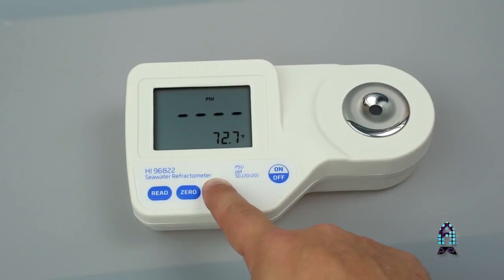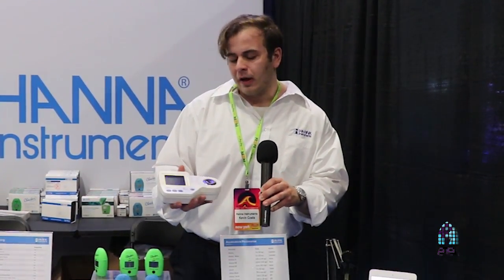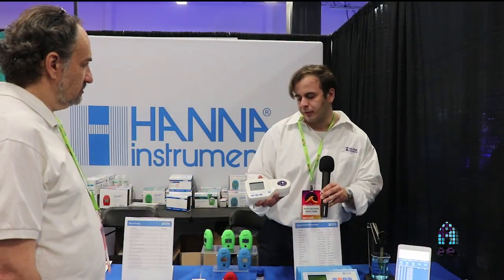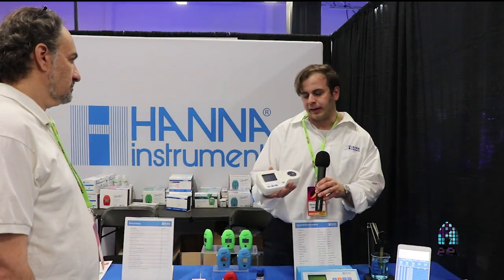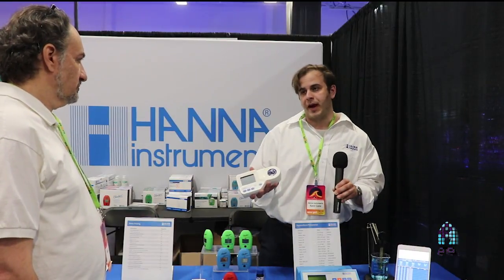Another popular unit we have is this digital seawater refractometer. A digital seawater refractometer is nothing new to the hobby, but we've had one around for quite a while that's a really great unit — something people should consider if they want really accurate salinity readings when mixing saltwater. There's no calibration needed other than RODI water, and it automatically compensates for any sample differences in temperature. So if you're mixing up a batch of salt and your water hasn't heated up yet, a lot of optical refractometers only calibrate at a narrow temperature range. This one gives you an accurate salinity reading no matter what the sample temperature is, which has a really big impact on refractive index.